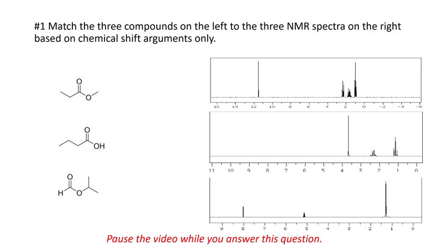Okay, here we go. As always, when we're solving these problems, what we're going to do is determine the symmetry of the system, how many different groups of hydrogens we have. And we look at these spectra, we very quickly can see, here we have 3 at this one, here we also have 3 at this one, and the top one has 4 different groups. So that's significant, and we should be able to nail one of these just with that info. So let's look at the top one.